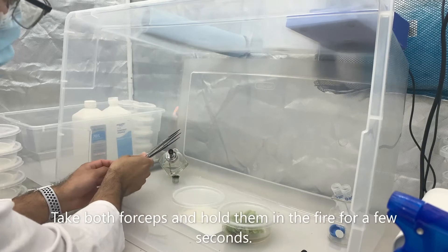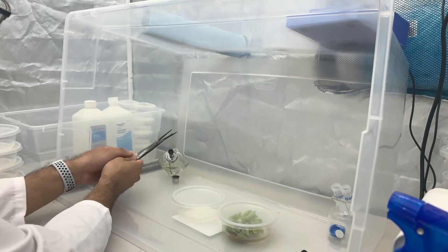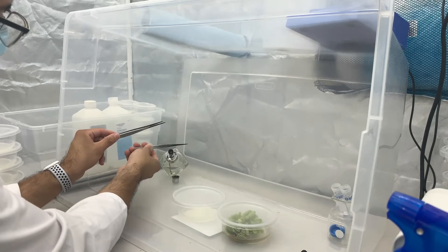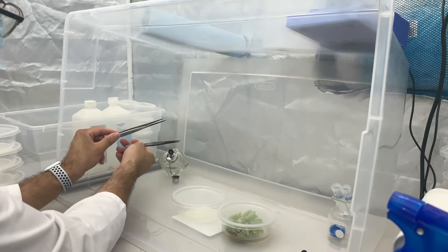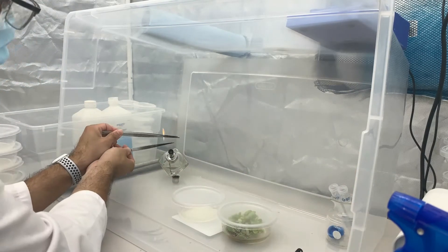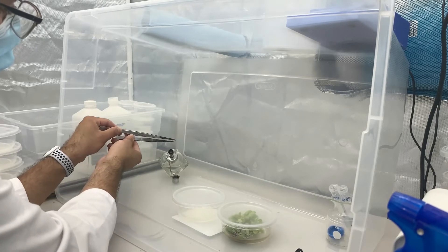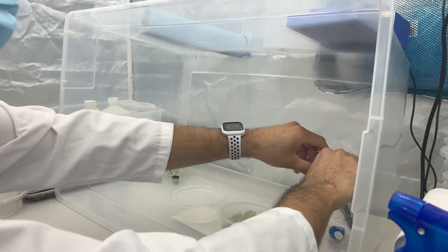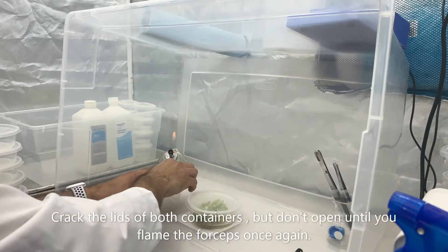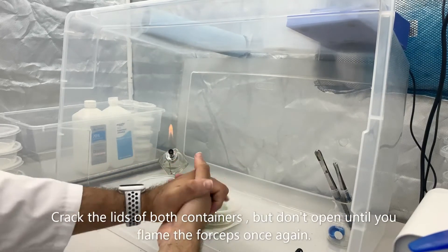We're going to take our forceps that have been soaking in the 70% isopropyl alcohol and hold them over the fire for a couple seconds just to make sure they're thoroughly sterilized. Gently crack the lids of both containers, but don't open quite yet until you flame the forceps one more time.